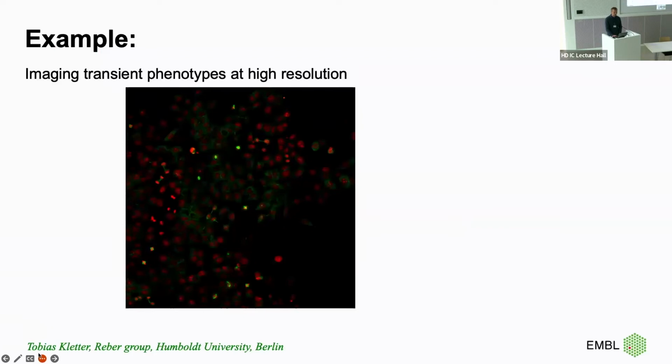All right, just to begin with, what we think of as smart microscopy, or we used to use the term adaptive feedback microscopy, pretty much fits what Raphael was talking about before. It's actually allowing to control the microscope workflow, from being predefined to being decision driven. And this is what people do anyway, right? This is what people have done manually over the years.